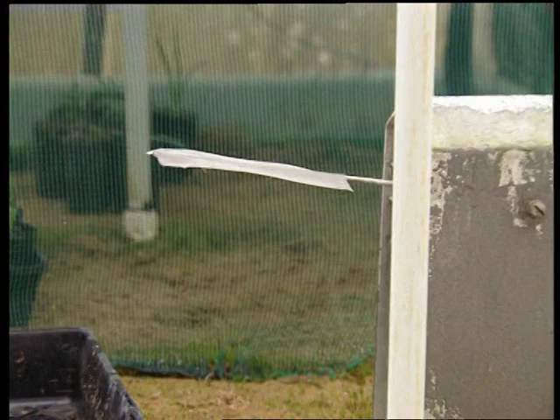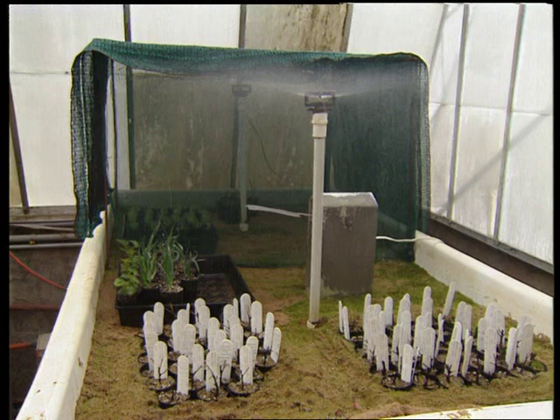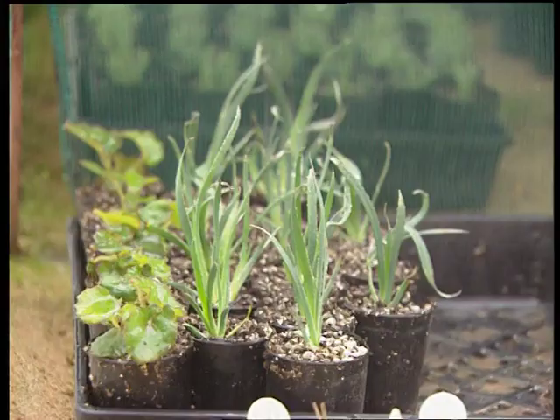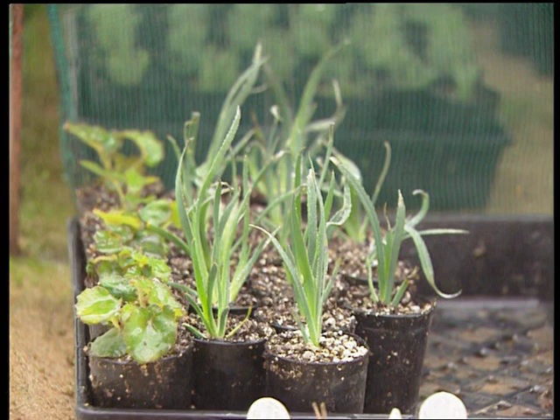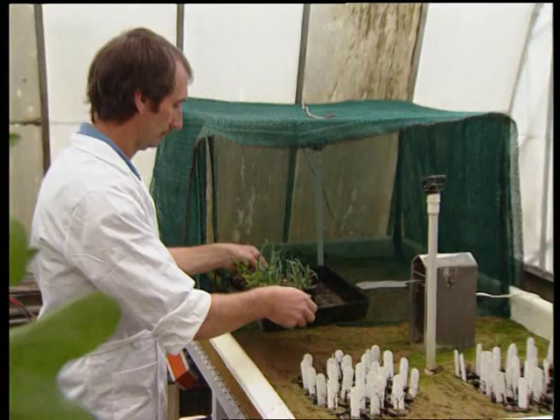To reduce light, a shade cloth can be used. Shade cloth comes in various densities. Up to 70% of the light may need to be eliminated in the first few days. Gradually, the light intensity is increased and the humidity is decreased until such time as the plants have developed functional roots.